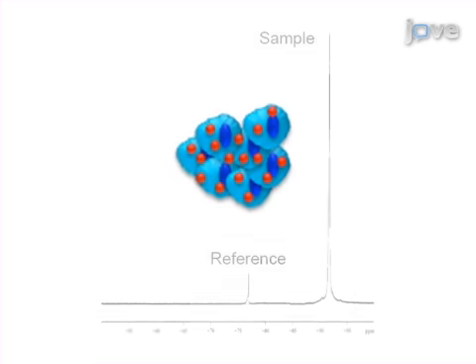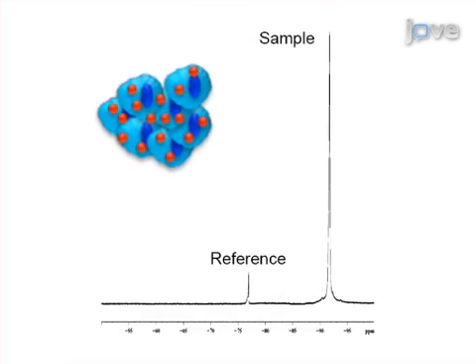The second step is to quantify the 19F content per cell, which can be done using 19F-NMR with a known reference. The 19F content per cell is assumed to remain constant during the experiment, otherwise, correction factors must be calculated.